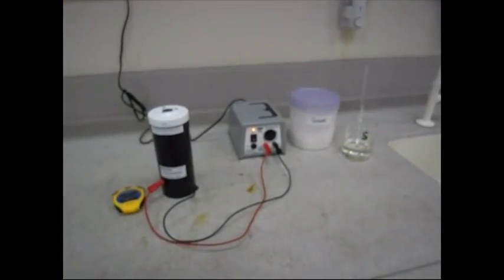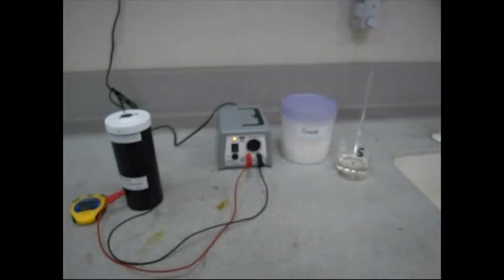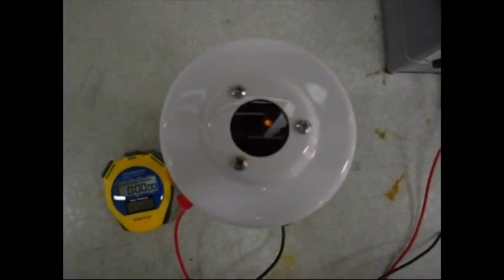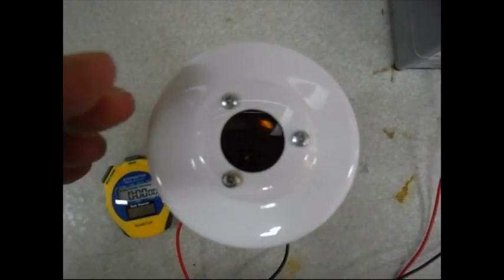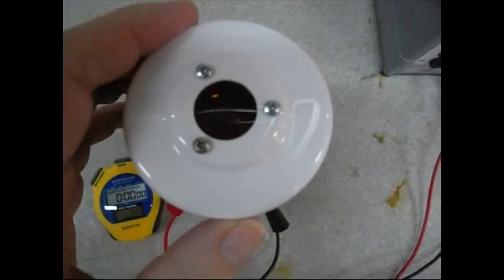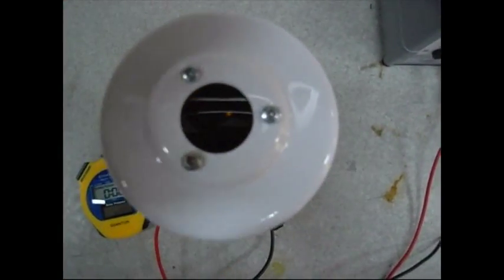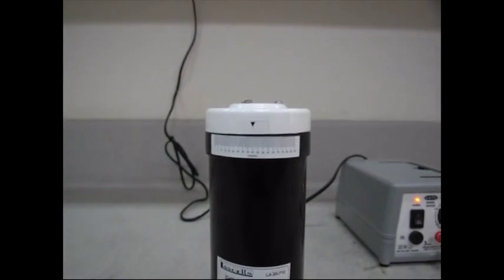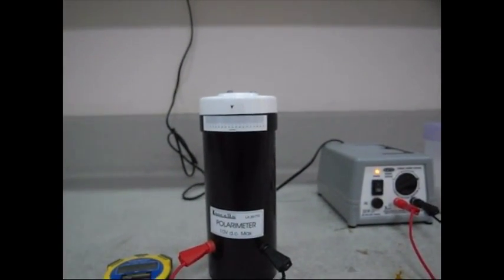Here's another experiment with the polarimeter. This one is going to use sucrose. Looking down into the polarimeter, we can see complete extinction of light at 45 degrees on this polarimeter.